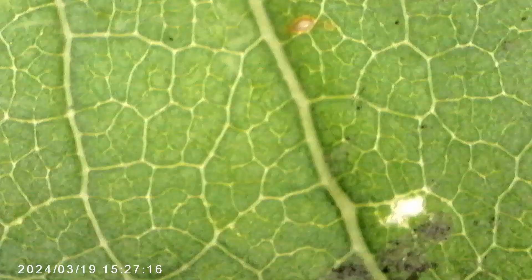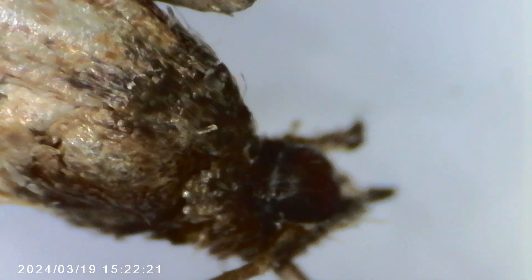The way it works is it's detachable here — it doesn't need to be on the base. You can take it out and go outside to look at everything you want. It has this little plastic piece you can take off, and depending on how close you are to an object is how big it's going to show. When you are using just this part of the microscope, you're probably going to be putting things down on the plastic and it's going to be zoomed in to crazy high levels.